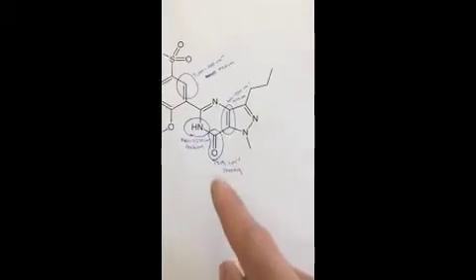Get that with your amines. Your alkenes with the double bonded carbon to the hydrogen stretch there is 3100 to 3000. This is where I found the 1715, the C double bond O oxygen. That's in your ketones, like I explained earlier. It's right here, right there at that double bonded oxygen to the carbon.